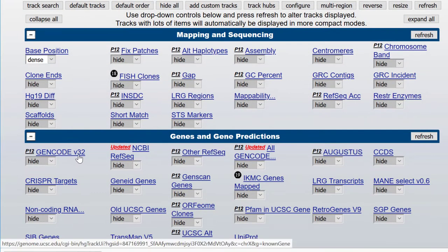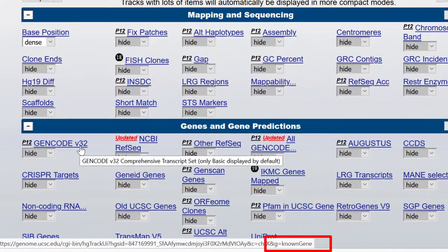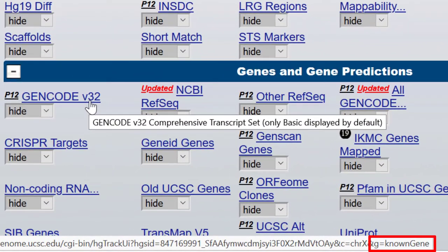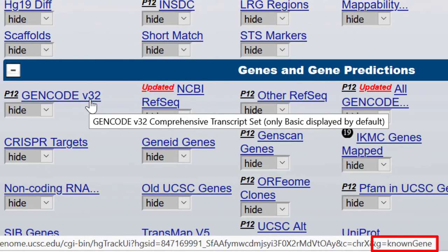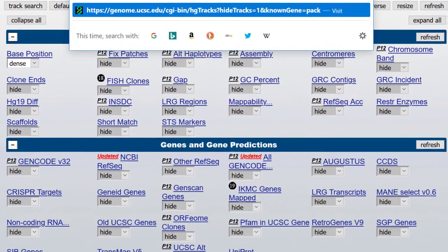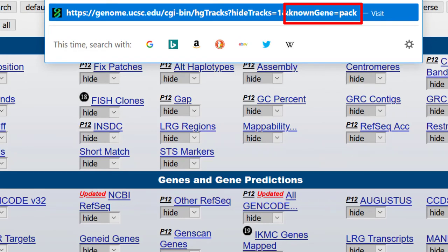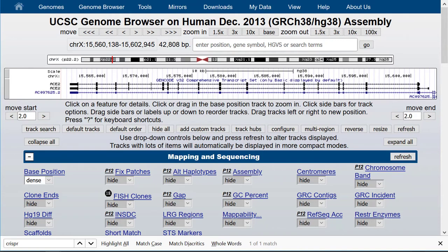Let's add back the GenCode genes track and in the process learn how to identify the table name for any track. One way to get the table name is to mouse over the label in the track controls and look for the variable g. You see that the table name for the GenCode genes track — which is called UCSC genes in hg19 — is knownGene. We can set ampersand knownGene equals pack to load the track. With no position equals parameter, the track opens at whatever position we were at before. Note that all of the parameters are case sensitive.